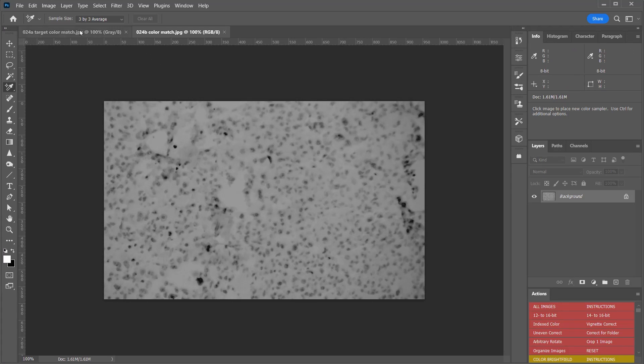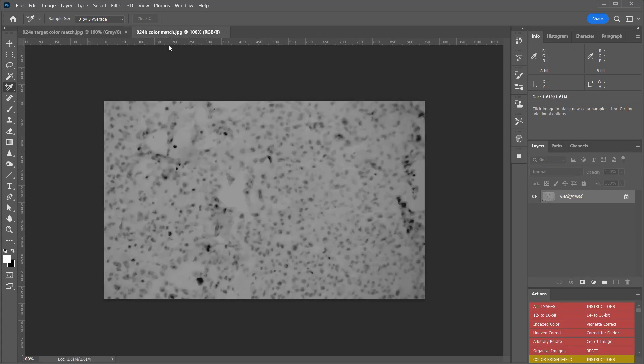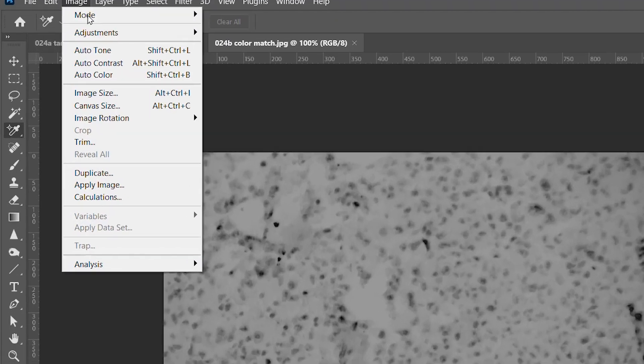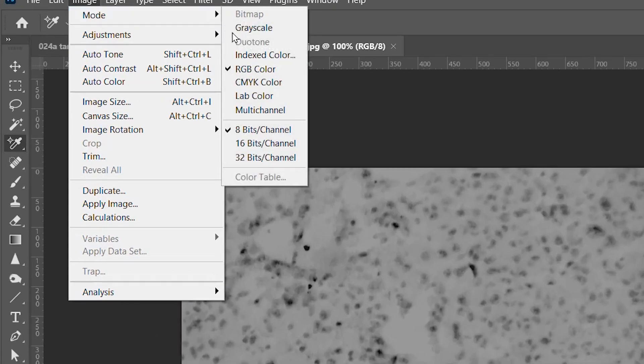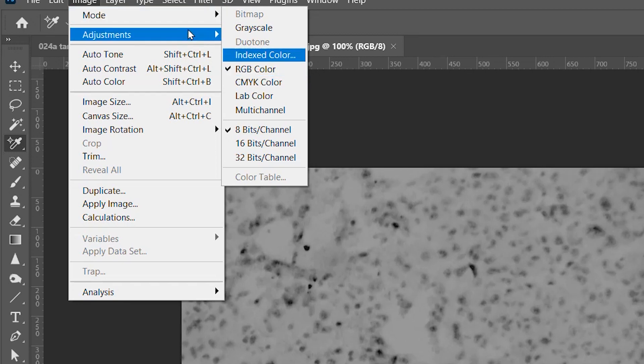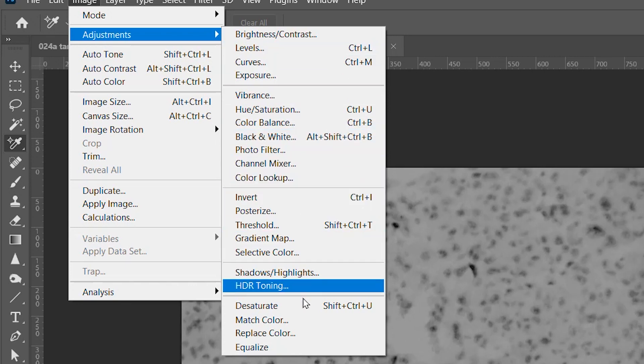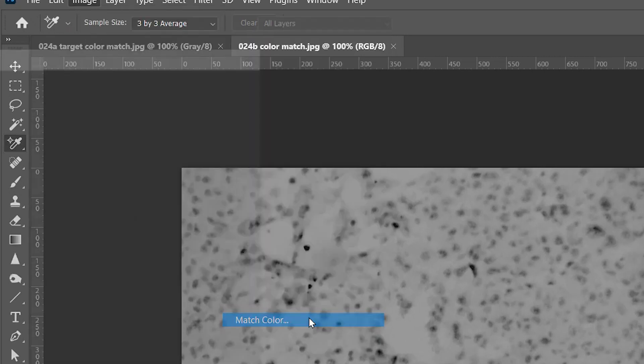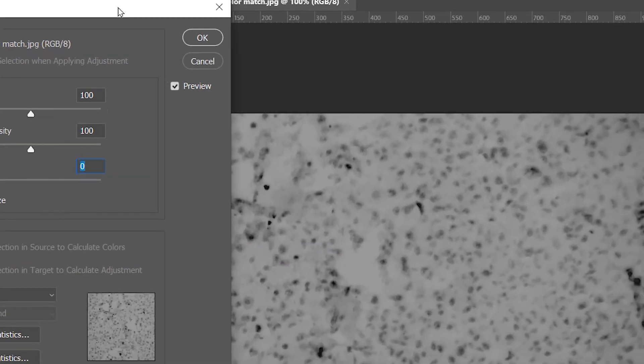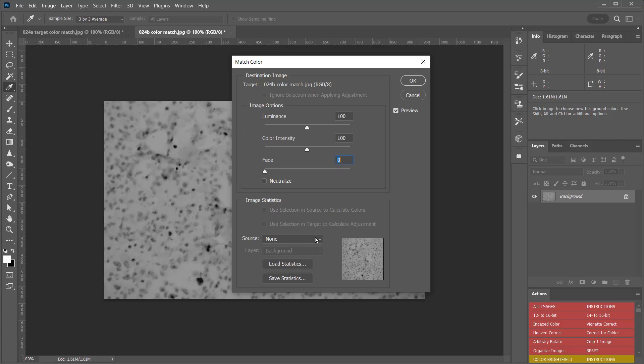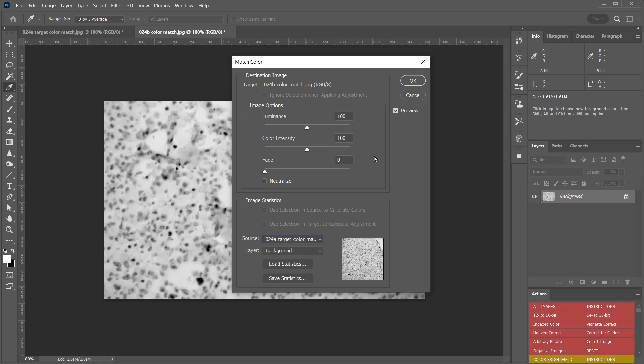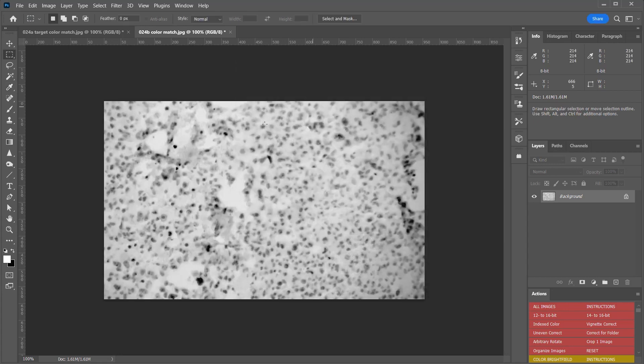To do that in Photoshop, here I have two images, one that's darker than the other, and I want to match the darker image to the lighter image. First of all, the image has to be in color mode, RGB color mode. Once it's in that mode, you can go to Adjustments, and then go to Match Color. To set tones of one image to match the other, under Source, choose the other image, and now both tonal ranges will match.